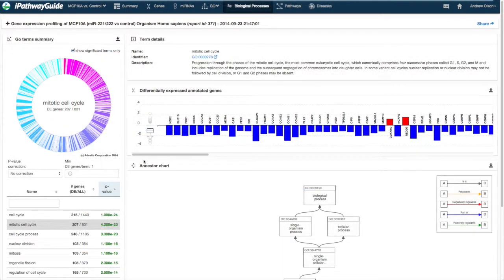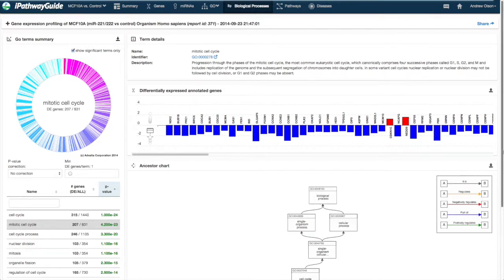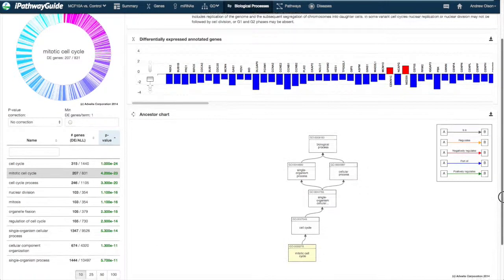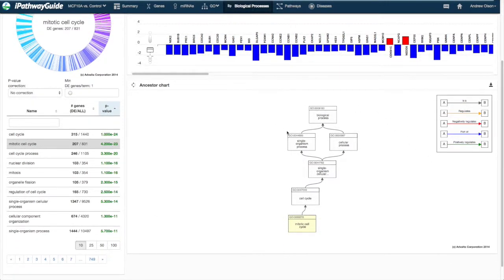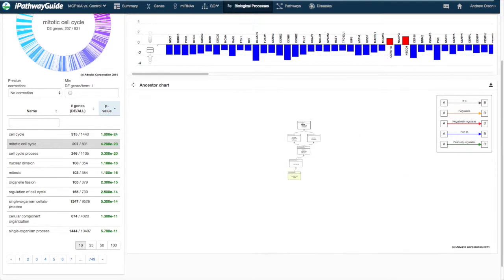Finally, the ancestor chart for the selected term is also displayed. This chart shows the hierarchy for the selected term.